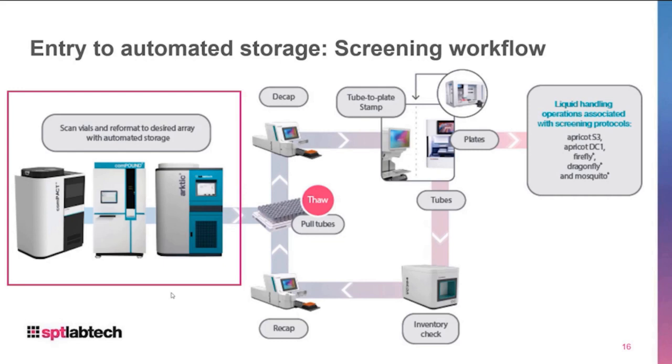So one thing I wanted to talk about is automated storage, coming back to that screening workflow we saw in the past with manual storage, scanning, and resorting with the XL 9 or 20 to tube pick and place reformat. We brought automated storage into that same workflow.